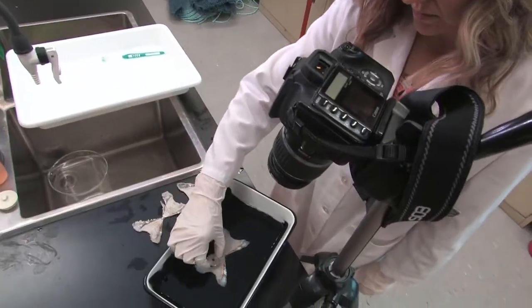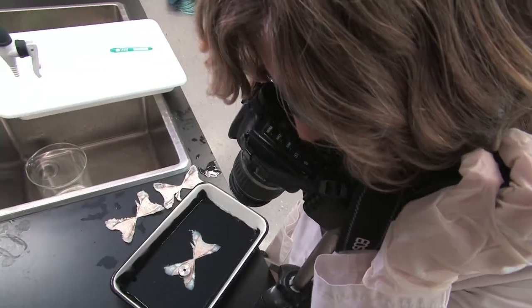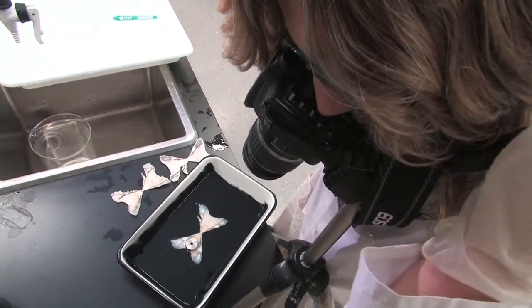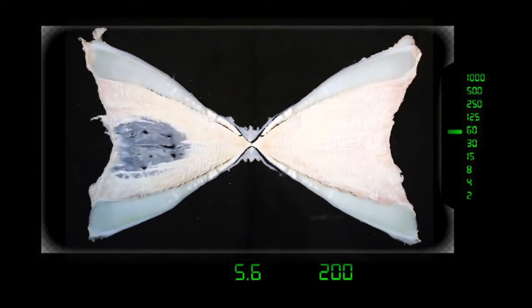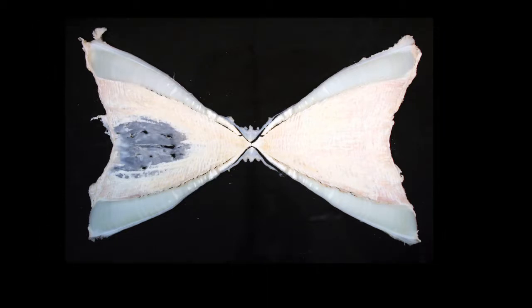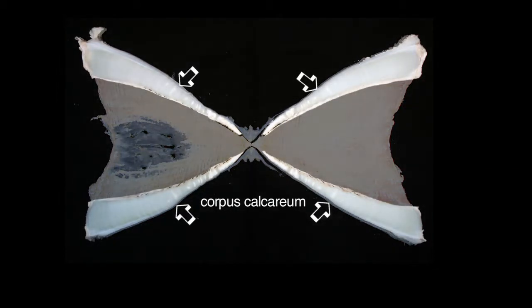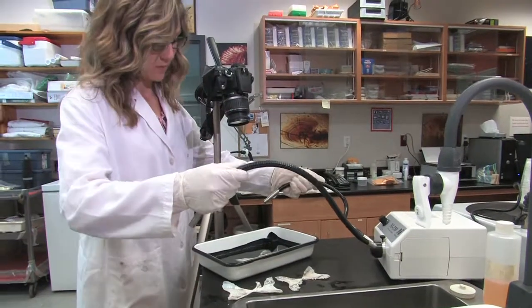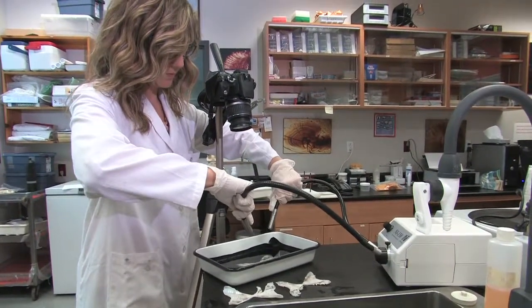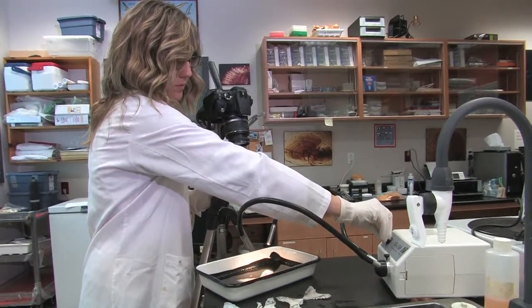The section cannot be imaged without being covered with fluid. You can use small weights to hold the center of the vertebra down while you image it. The black felt will provide contrast to the light colored vertebra. Frame the image so that the vertebra fills the field of view. The image of the section has to be in perfect focus. Image enhancement will be done later, so don't be concerned if the growth bands are not clearly visible, especially along the corpus calcareum, the area near the edge where the vertebra will be aged. Due to the large windows in this particular setting, natural light is sufficient, but you can use a fiber optic lighting source set at oblique angles to light the vertebra for imaging.